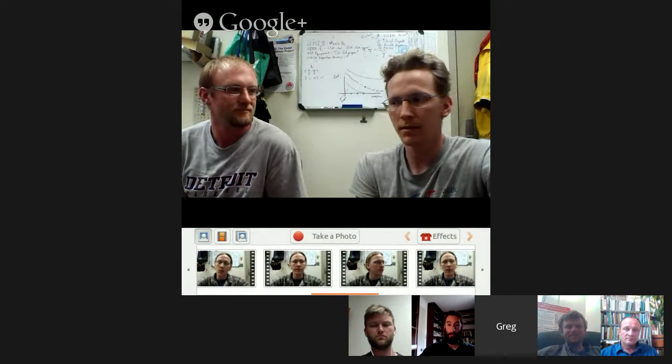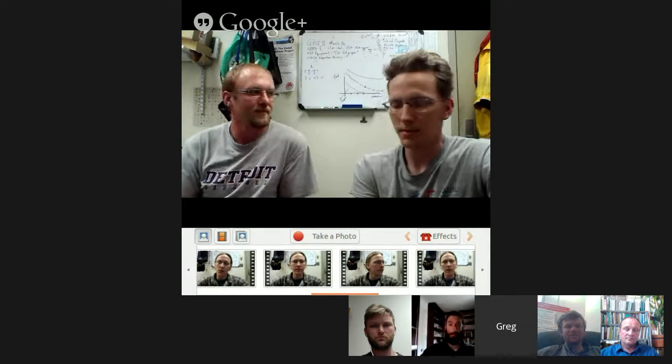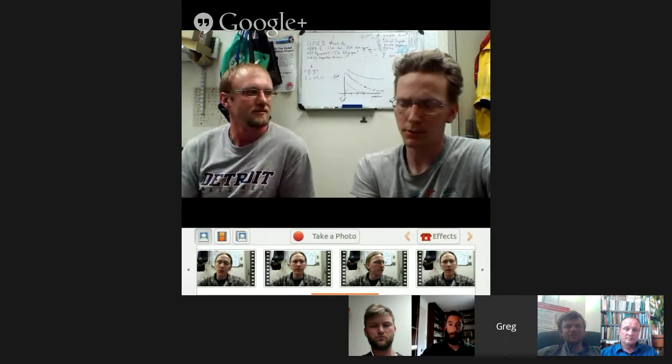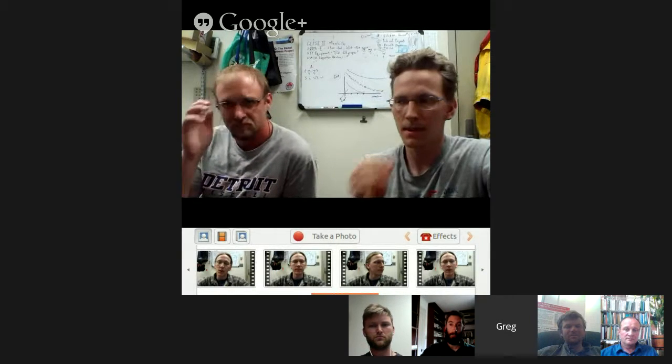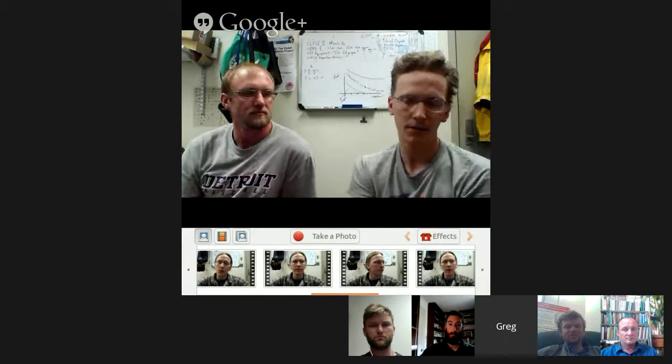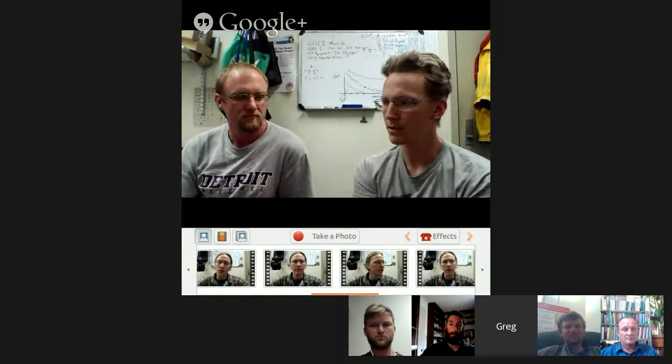We're also working on, as it relates to soil, which I would love some thoughts on this, we have a little cyclic voltammetry add-on, if you've ever done cyclic voltammetry before. And then there's a group here that's using cyclic voltammetry to identify very specific compounds. For example, they're using it to identify pesticide residue on fruits and stuff like that. But it's a really general-purpose platform.